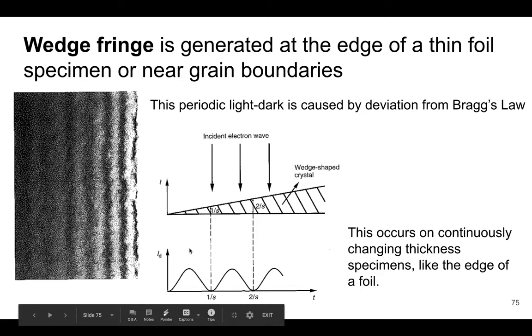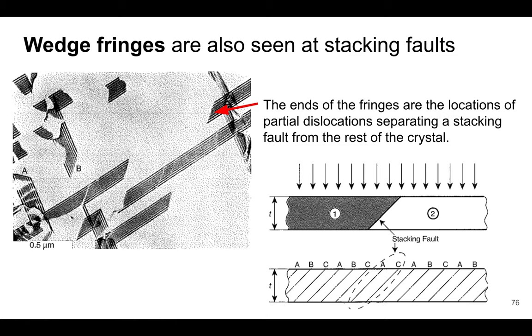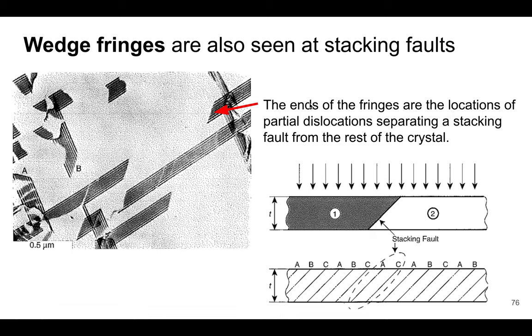You can see the wedge fringes here, corresponding to the intensity shown below. We can also see these same wedge fringes as a result of stacking faults. A stacking fault is essentially an error in the stacking sequence — we should have A, B, C, A, B, C, but in this case B is missing. The edges of those fringes are the locations of partial dislocations that separate the stacking fault from the rest of the crystal.